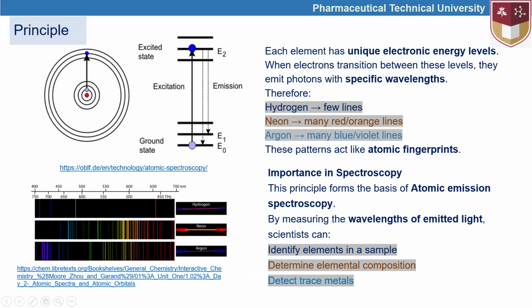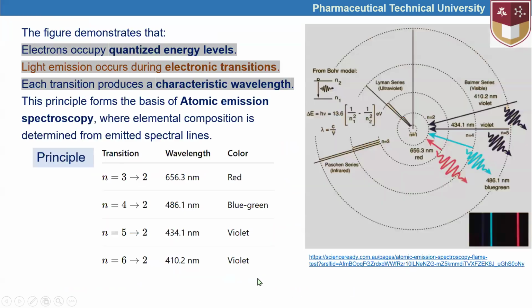For compounds having a molecular weight higher than 3000 AMU, it is possible to identify them by using the mass spectrum. The atoms cannot be identified by using mass spectrum based on those principles, and the presence of atoms in tiny, traceable amounts can be identified by using atomic emission spectroscopy. This is about the detection of trace metals as well.